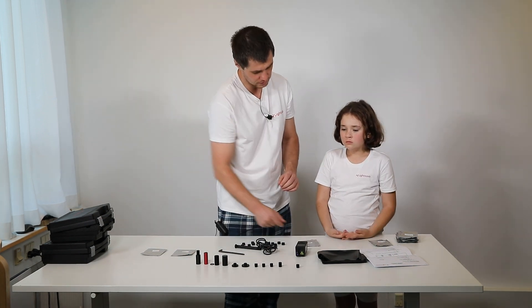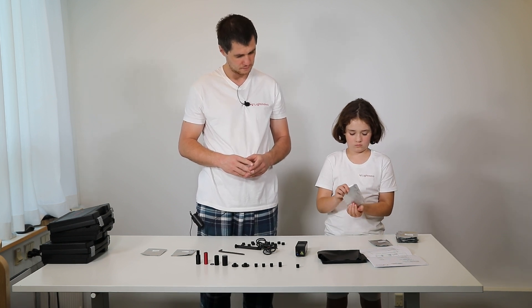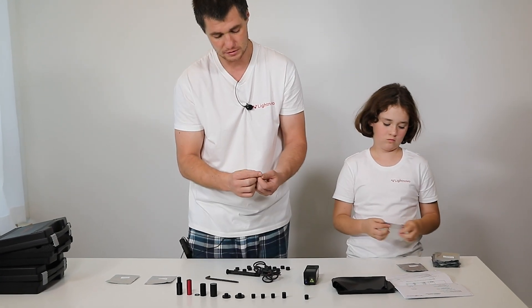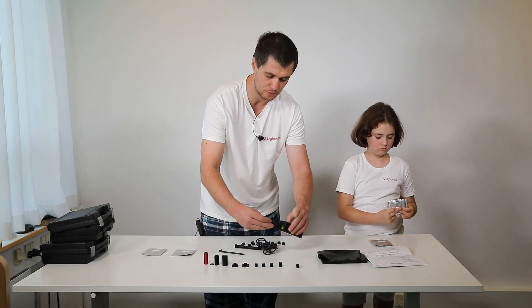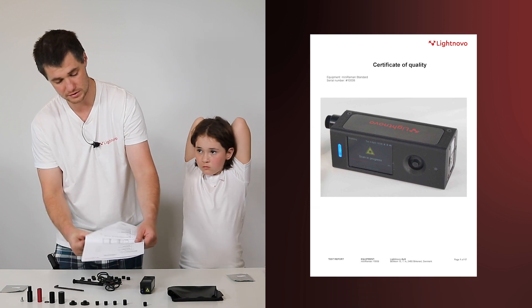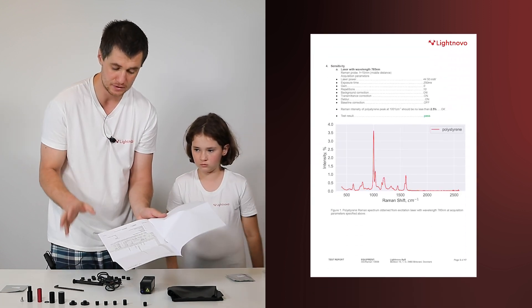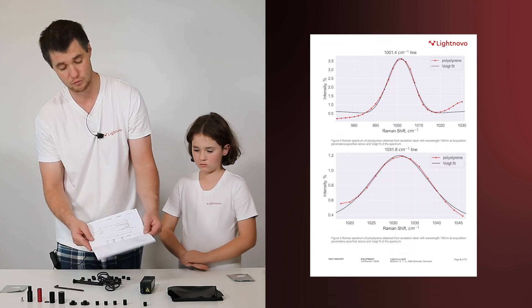Now let's look at the calibration screw. It's just one screw but not that simple — inside we inserted and glued polystyrene, our calibration material. You attach it similarly to another screw and focus the same way. At a certain distance of adjustment you will get the maximum signal of polystyrene. Then you open our certificate of quality and you should get a Raman spectrum very similar to the one shown. If the signal is less than what was measured during calibration at the factory for both lasers, you can return it to us and we will help you reach maximum performance. You can also test the wavelength calibration accuracy with polystyrene peaks.